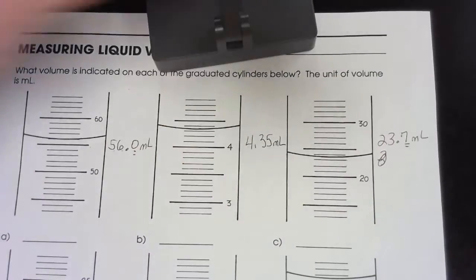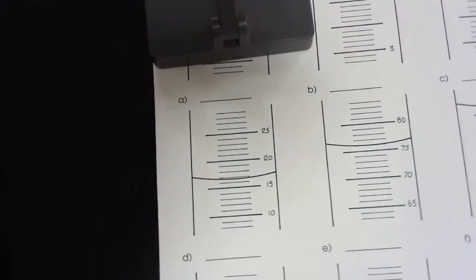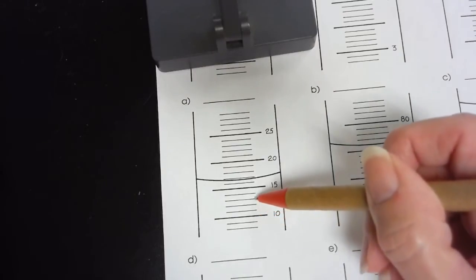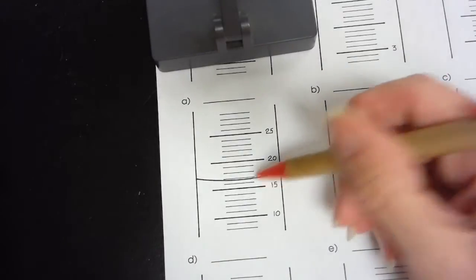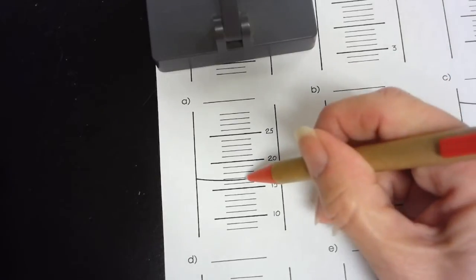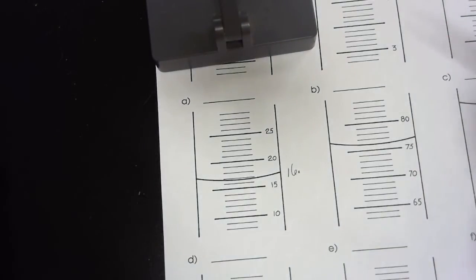Okay. Let's go to this one right here. Okay, this one is measured in, let's see, 10, 11, 12, 13, 14, 15. These are measured in ones. So this is going to be 16 point, and it looks to me like it's definitely more than 0.5.